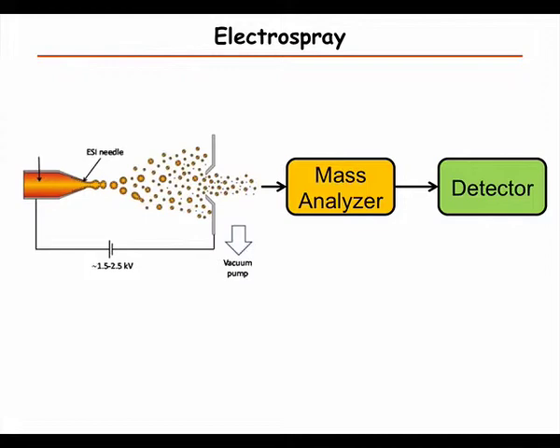It's difficult because you want to have a small hole, because you're pumping here, and you're limited in how much you can pump. So there's a lot of losses, and especially companies are trying to optimize that all the time. So hence you need a large sample to begin with. Yes. Could you recollect those lost samples? One doesn't do that really.